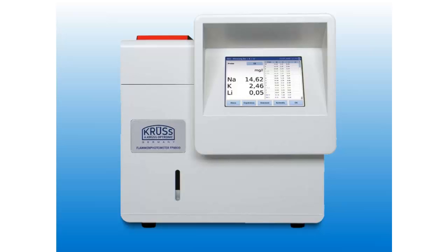Flame photometer, also known as photoelectric flame photometer, is one of the most widely used laboratory devices to measure the concentration of chemical elements such as sodium, potassium, calcium, lithium, and barium in blood serum or other fluids. Besides its application in medical diagnostics, it's used in agriculture and industry too.